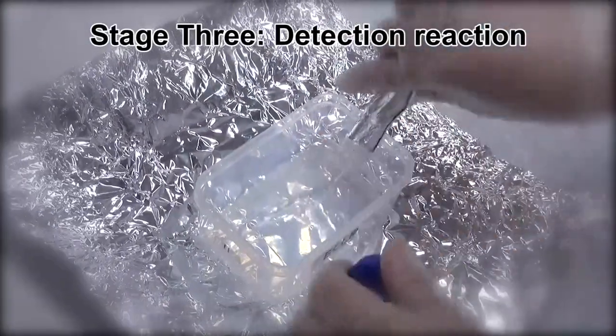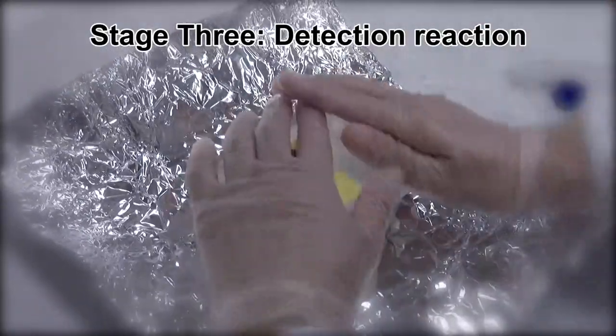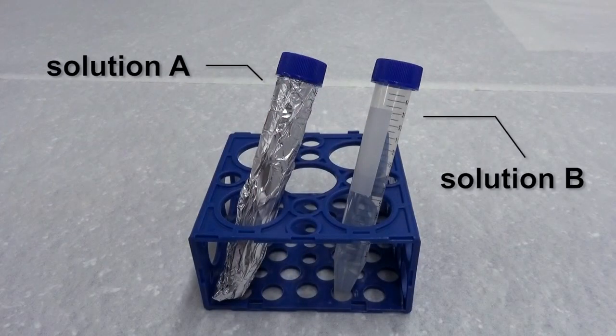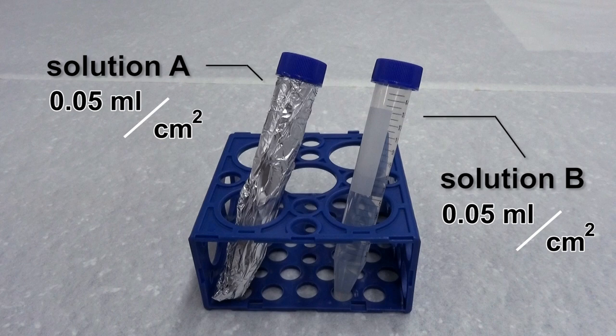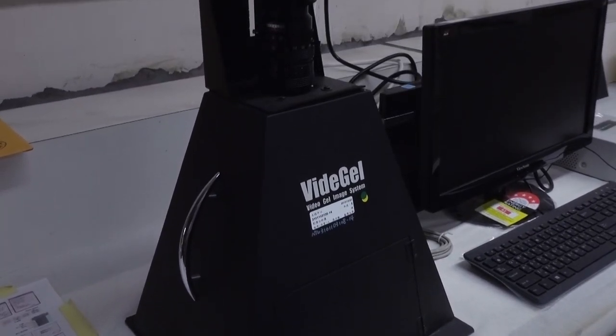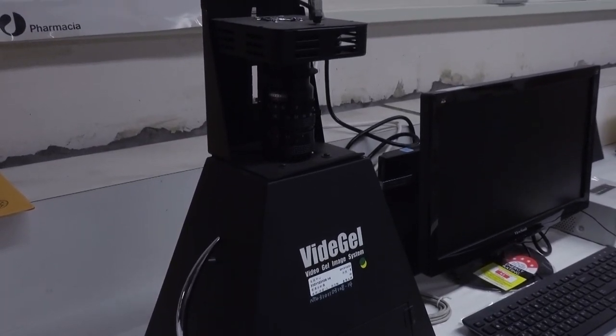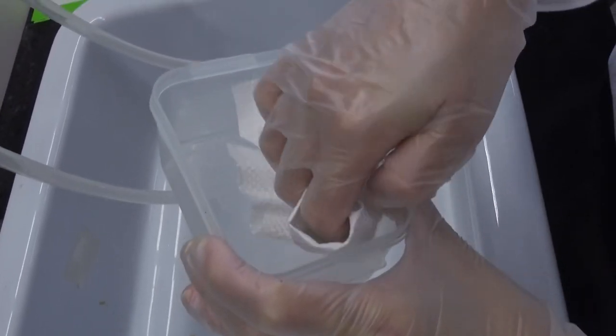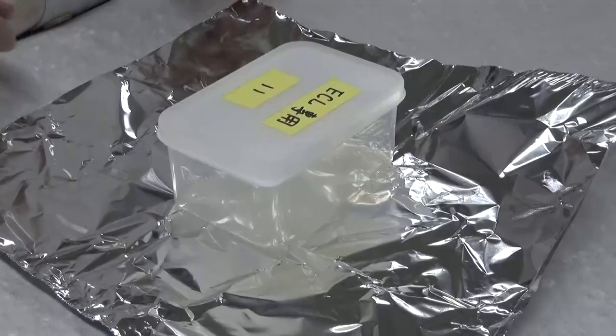Here we demonstrate Enhanced Chemiluminescence (ECL) detection. Have all the reagents and equipment ready. The ECL kit includes the reaction solutions and substrates. Calculate the amount of usage for each component before the reaction: use 0.05 ml of solution A and B respectively for each square centimeter of PVDF membrane. Note that solution A must be kept in the dark. Set up the Chemiluminescence Imaging System and software before the experiment. Thoroughly wash the plastic box for ECL with ethanol, label it with group ID, and wrap the box in aluminum foil.